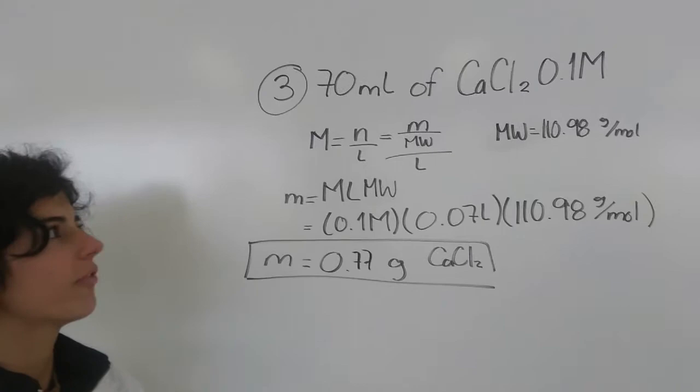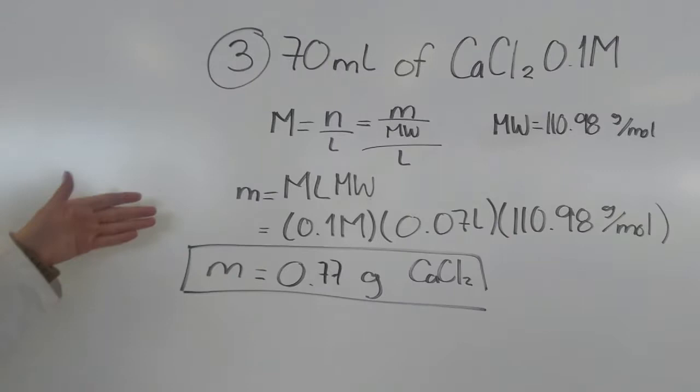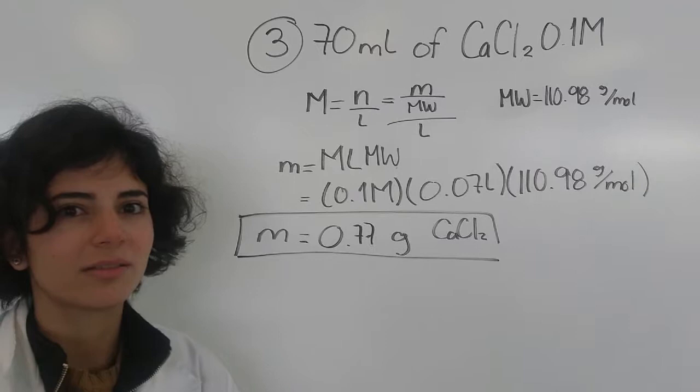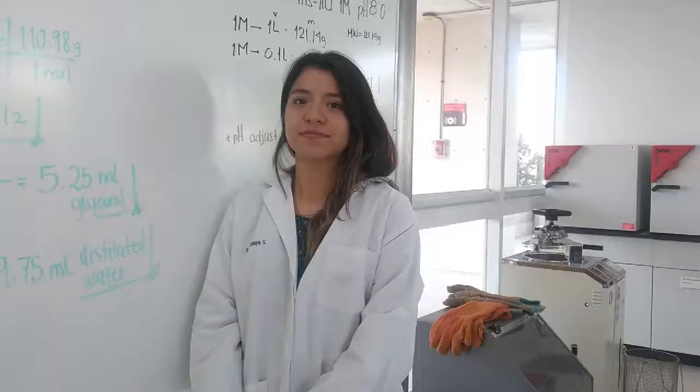For the third solution, we prepare 17 milliliters of calcium chloride at 0.1 molar. We use the molar formula to calculate the amount of calcium chloride needed. We follow the standard protocol for solution preparation and use a magnetic stirrer to dissolve the solute.